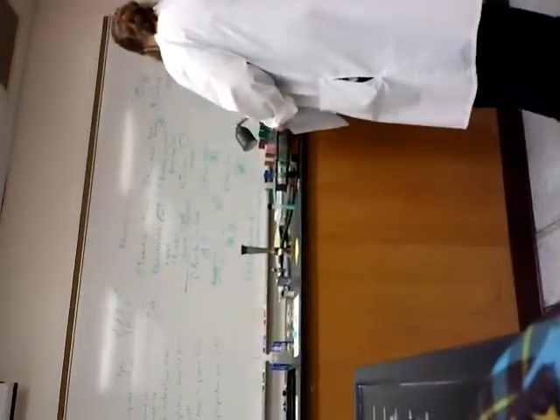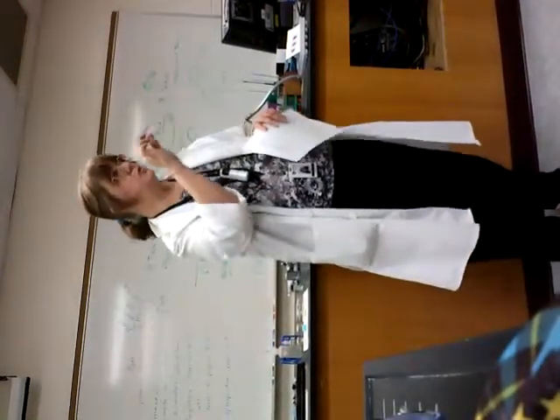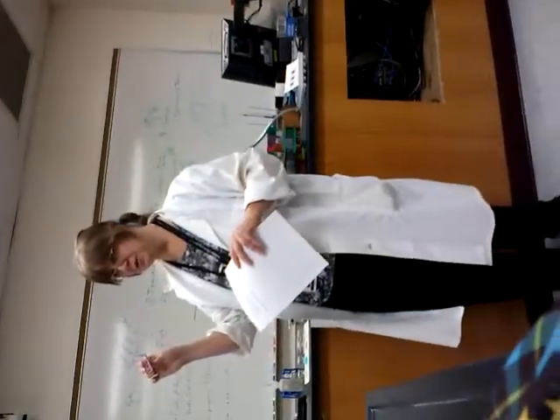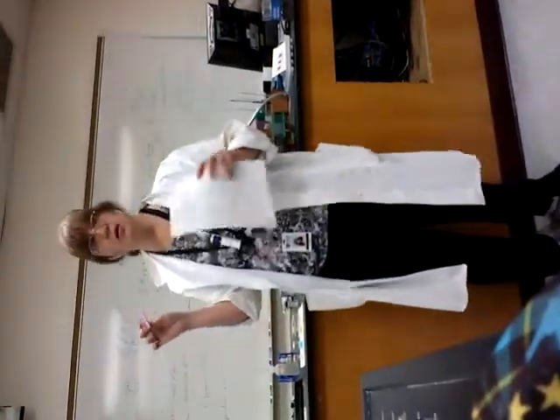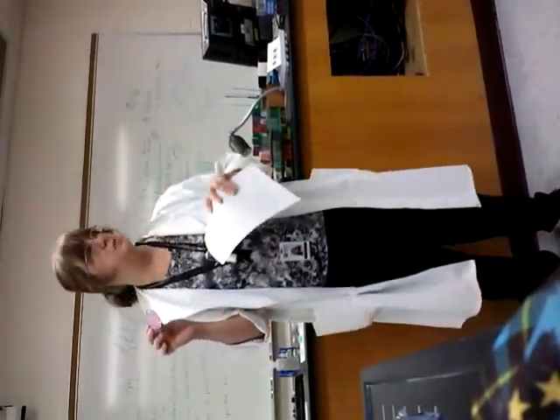If you collected coliforms, do you remember what this is? E-N-D-O. You took the membrane, which was white at that time, put it here, put the pink membrane onto it, well, pink media, and if you have a metallic green sheen, you had coliform in color. Coliforms, if you filtered 40 mils, you could calculate your organisms per mil.